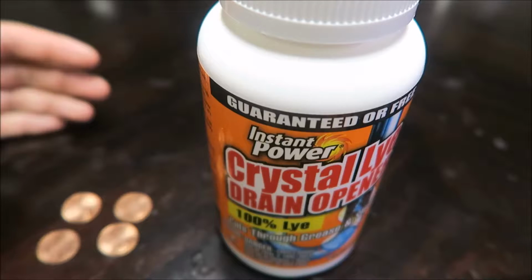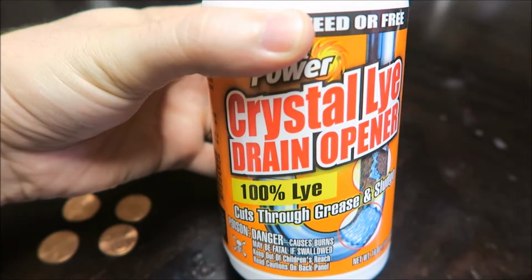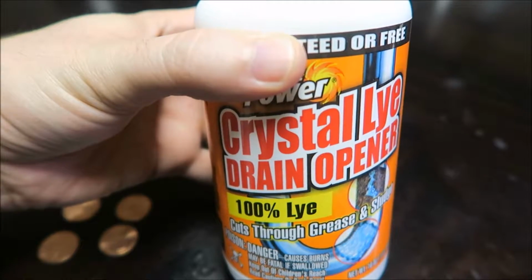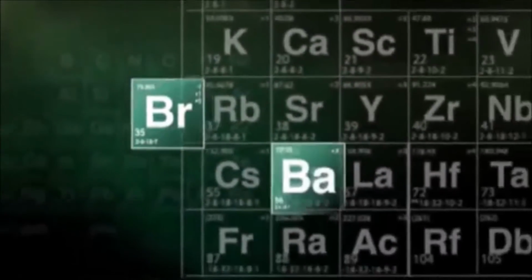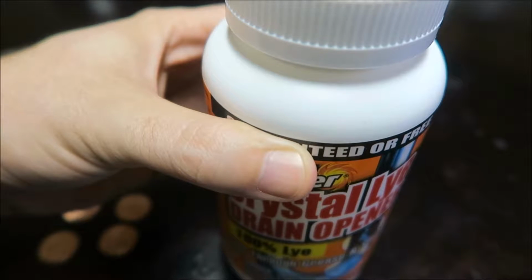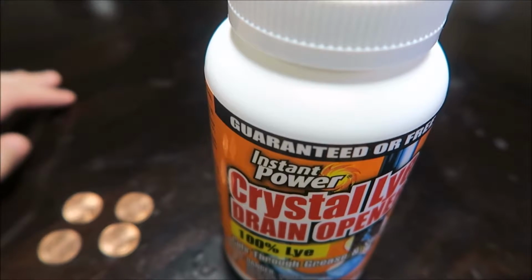This is sodium hydroxide. You can still sometimes find it in hardware stores with the drain cleaners or the root killers, and sometimes you can find it in craft stores with the soap-making kits. Unfortunately, lye is used to make certain illicit substances, and so a lot of stores are refusing to carry it anymore. So if no stores in your area have it in stock, you'll probably have to order it online. Now you can also make lye at home out of wood ashes, but it's a very tedious process, and I just don't want to go into that right now.